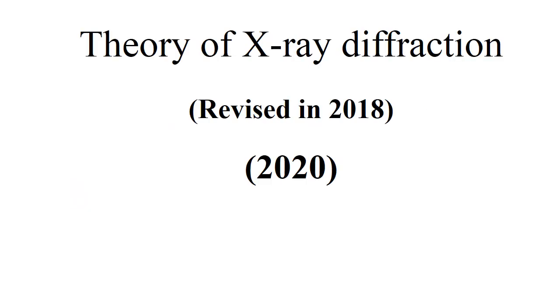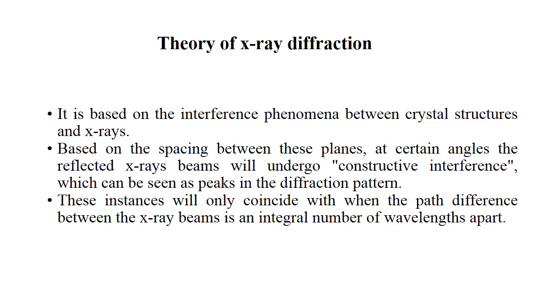Theory of X-ray diffraction. The theory of X-ray diffraction was given by von Laue and Bragg in the early 20th century. It was based on the interference phenomena between crystal structures and X-rays.